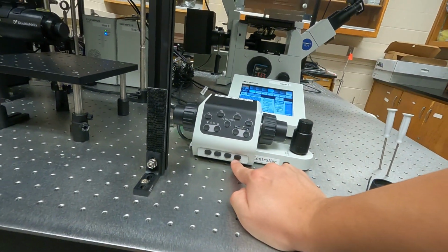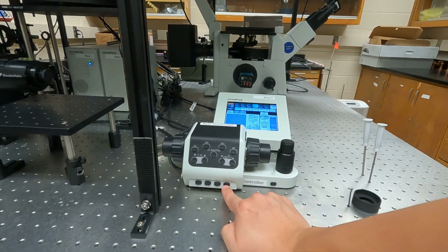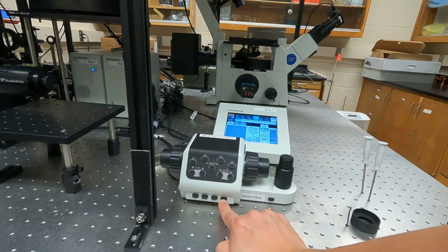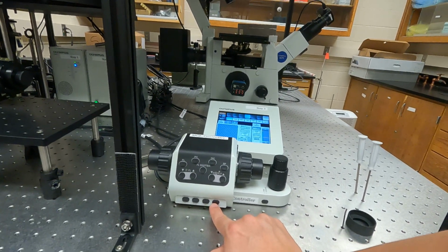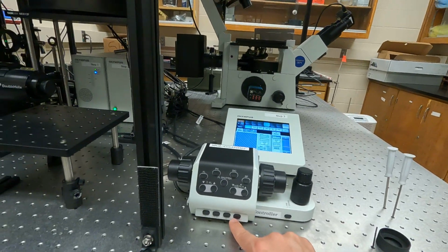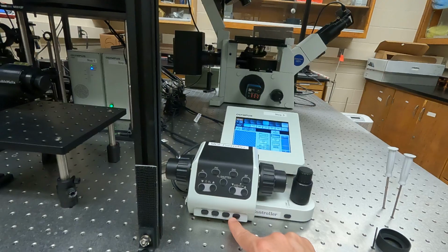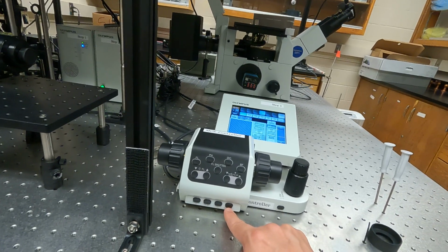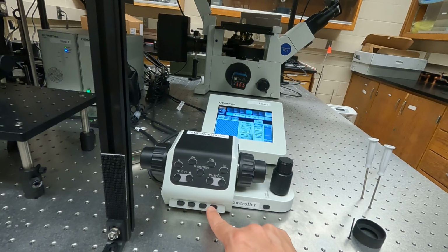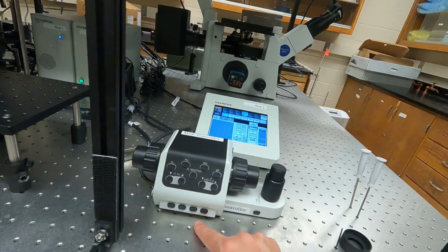If you click this rightmost button here, it will reset the objective position. Basically, the objective lens will immediately move to the lowest position. So this is sort of like the safe button. If this entire focus adjustment is messed up, you want to click this one once and then reset this whole thing to the original position.